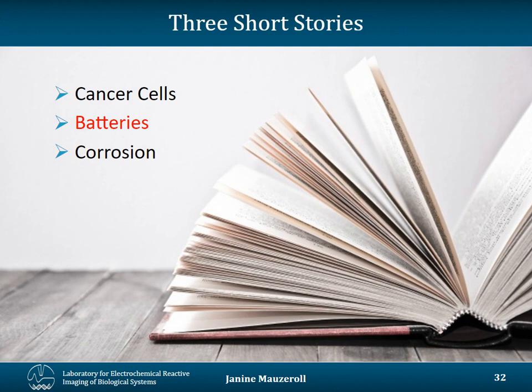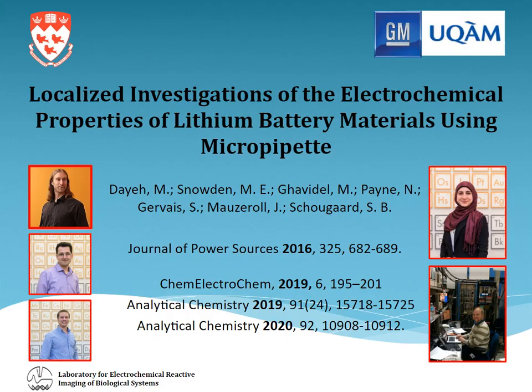Let me now switch gears and talk to you a little bit about how SECM can be used for batteries. And in this case, we will slightly change the experimental setup that we've been discussing up to now.